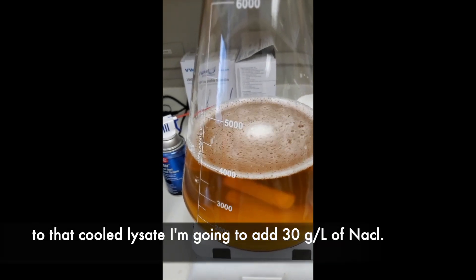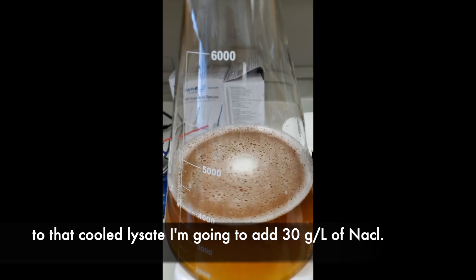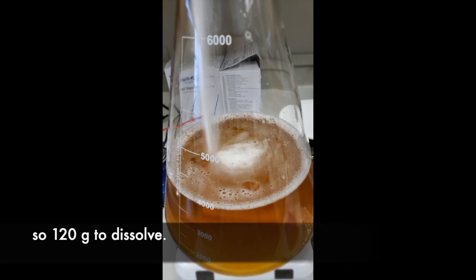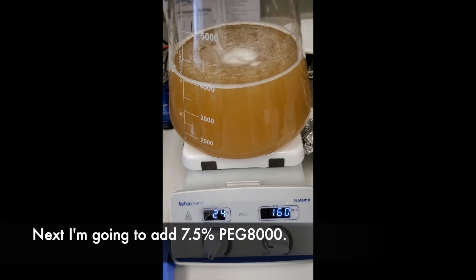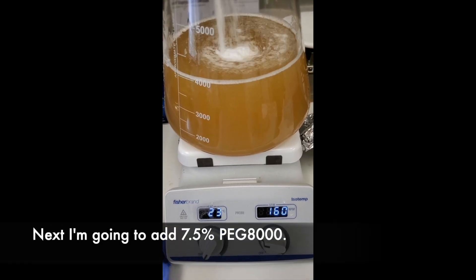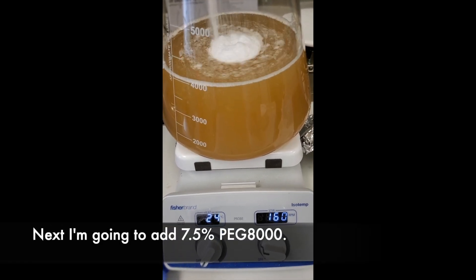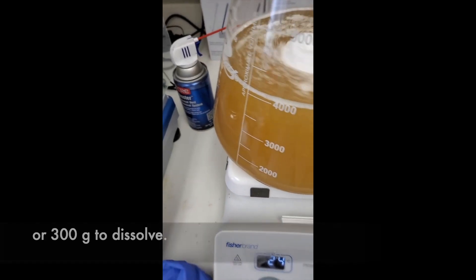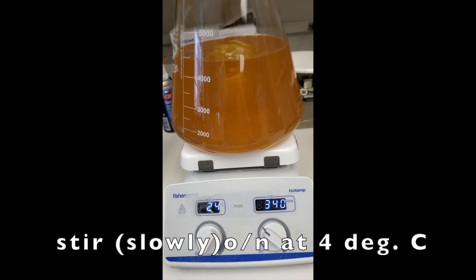To that cooled lysate, I'm going to add 30 grams per liter of sodium chloride — so 120 grams — to dissolve. Next, I'm going to add 7.5% polyethylene glycol, or 300 grams, to dissolve. Stir overnight in the cold room.